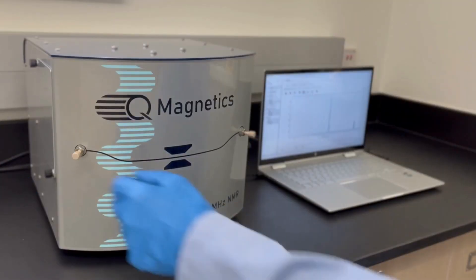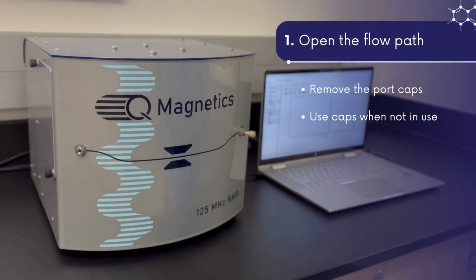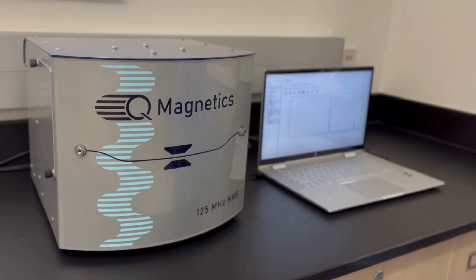When you are ready to use the QM125, open the flow path by removing the caps from the inlet and outlet ports. If the instrument is not in use, it is a good idea to keep the flow path enclosed with the caps.